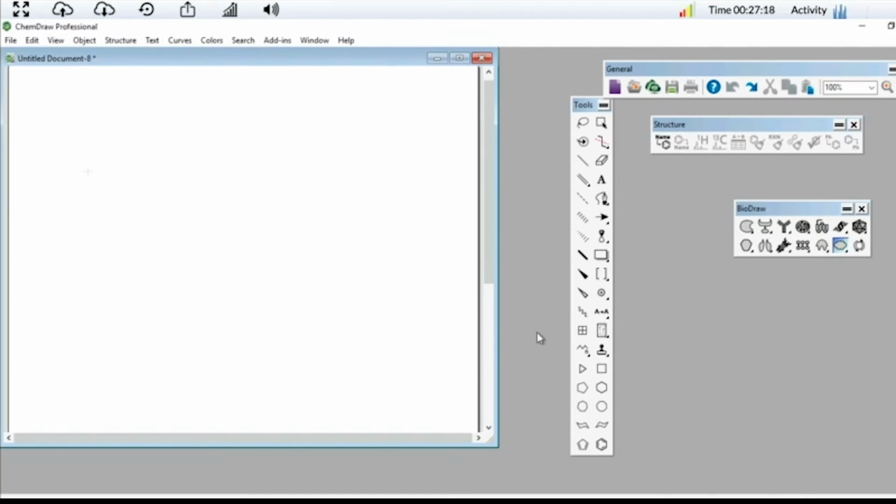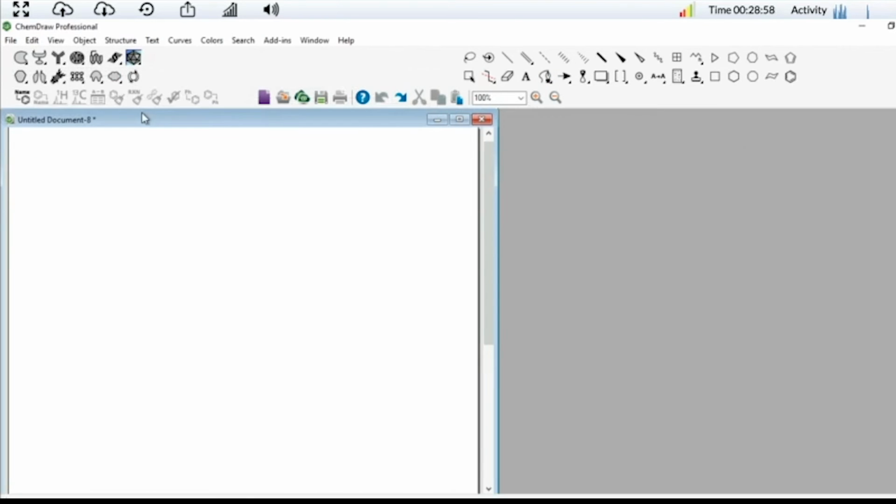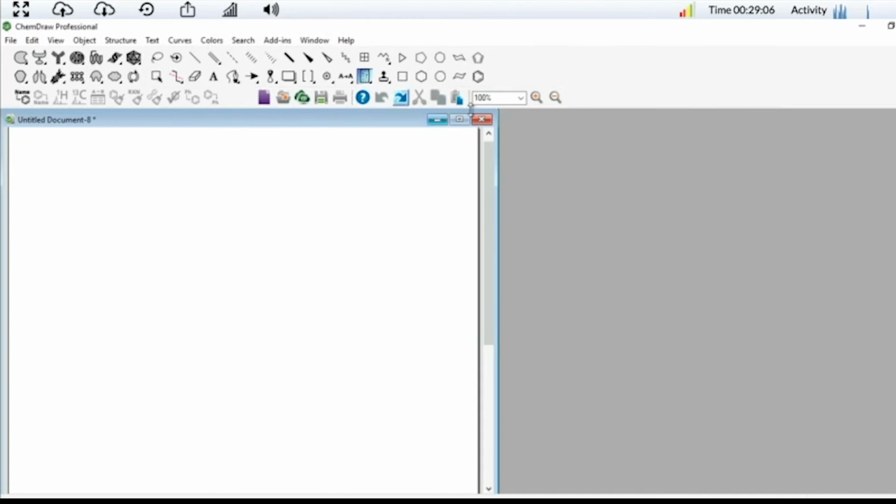Normally when you click on your wanted toolbars, they will show up on the side of your document. You can always move around the toolbars in whichever way you would like. I personally find it a lot easier for me to look up the toolbars I'm going to need when I put them all up together at the very top of the page.